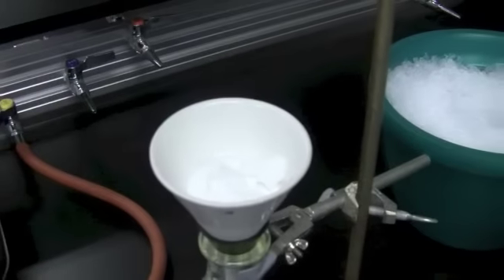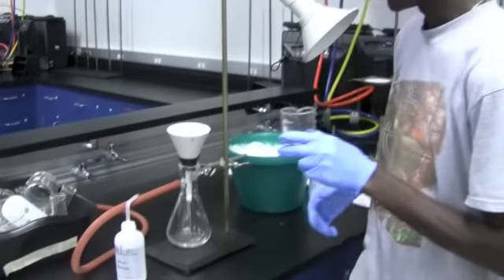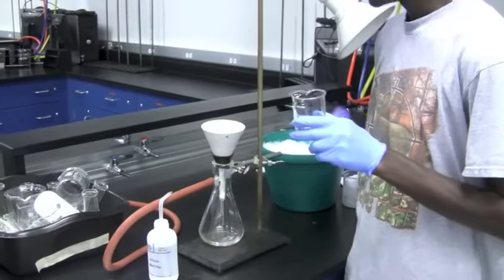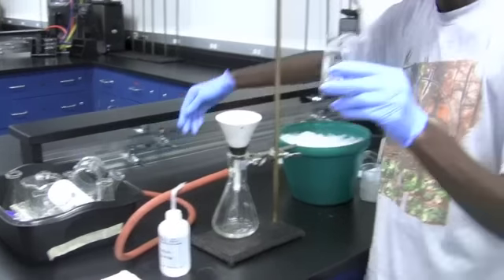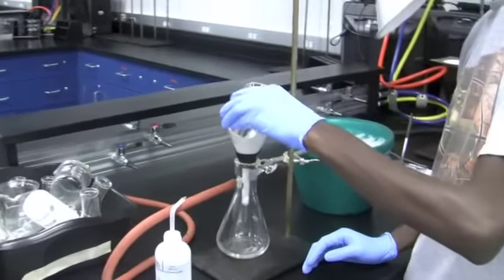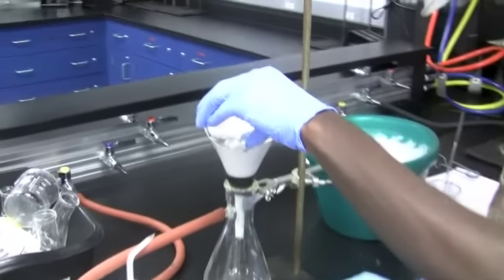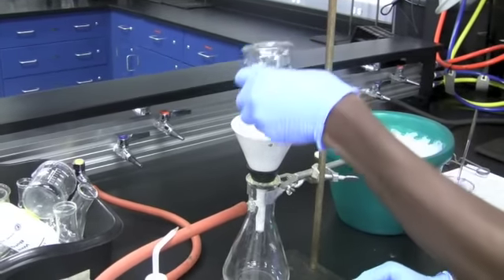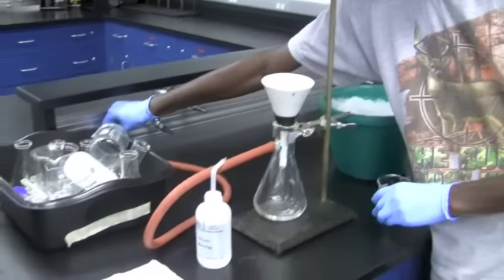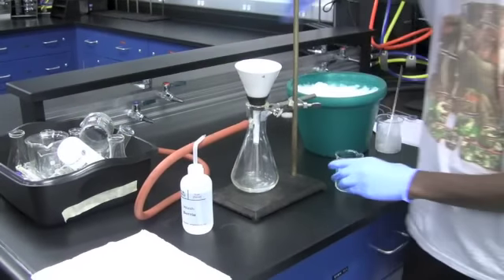Now after it's done, we're going to take our 50-50 water alcohol mixture and carefully wash the crystals. But before you do so, make sure to turn the vacuum off. And using your mixture, try and wash all the crystals like so. After doing that, you turn the vacuum back on and wait for it to filter.